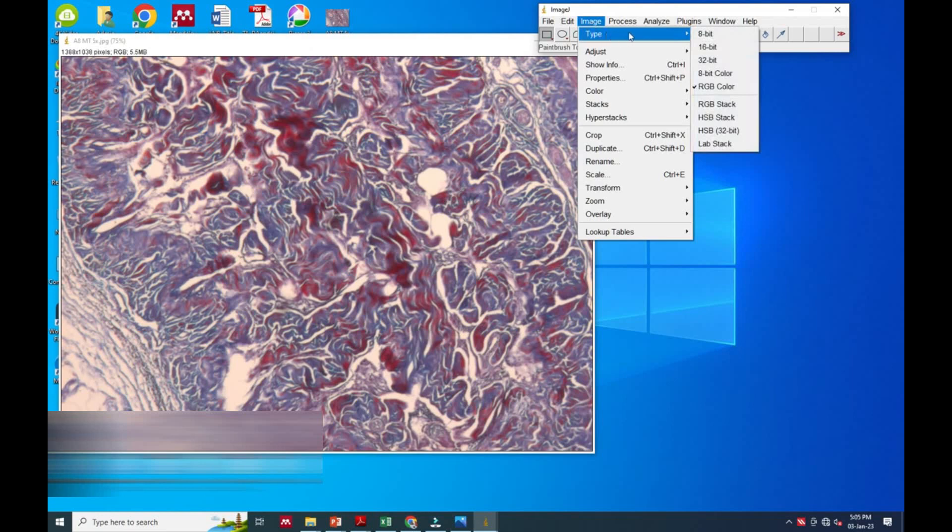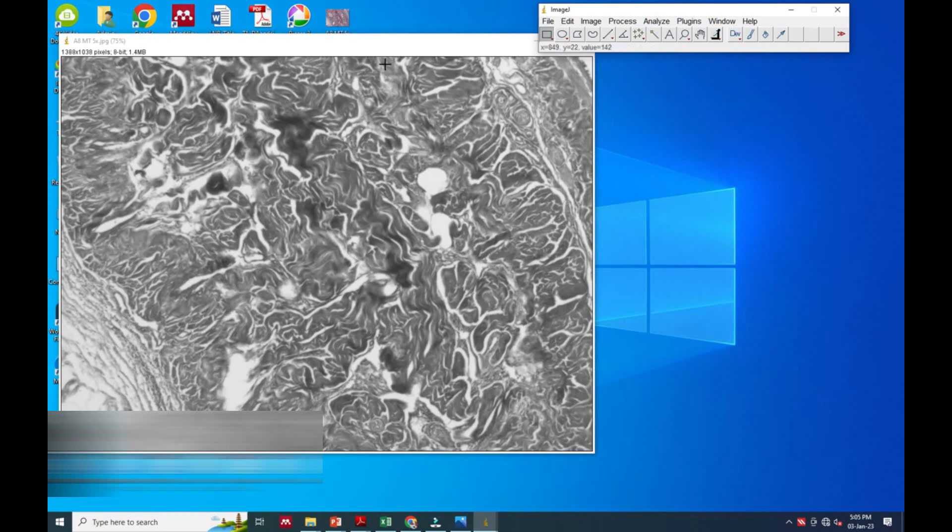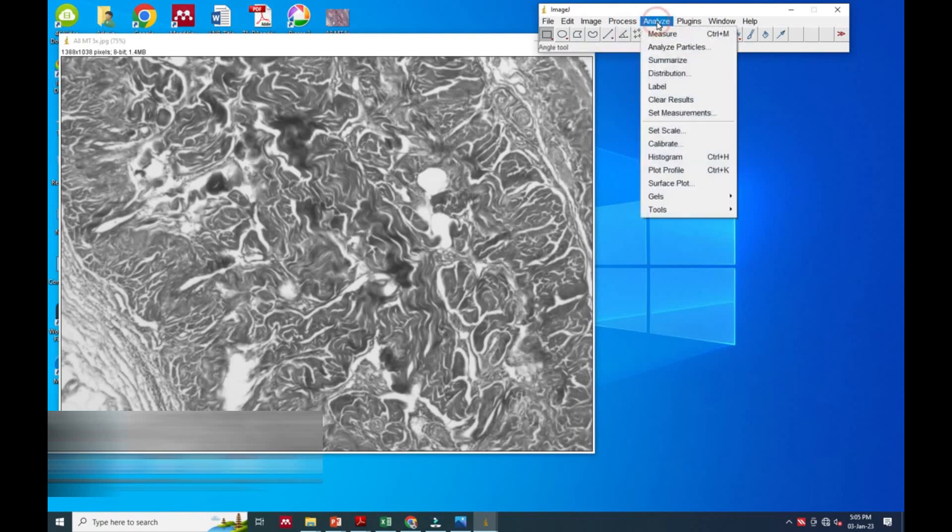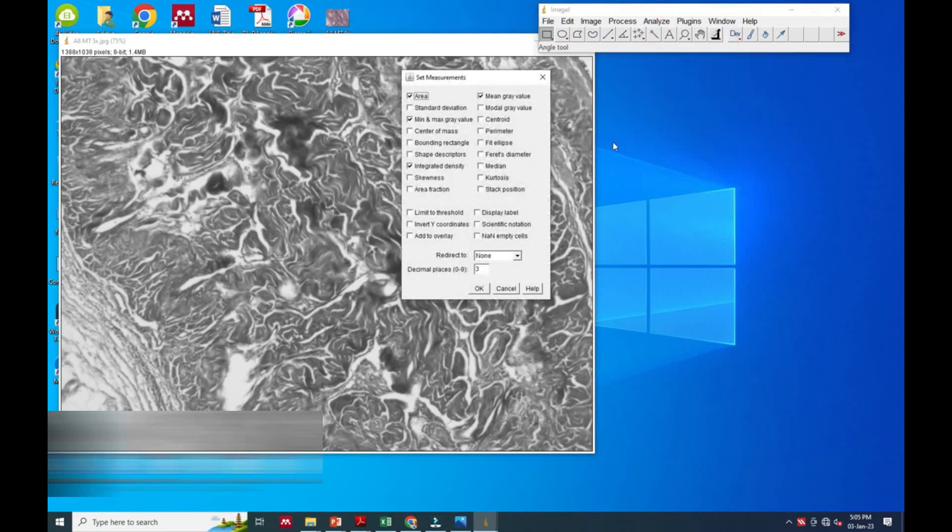In that we will go to Type, and in the Type drop menu we will go for 8-bit. With selection of 8-bit it will remove all image color. After that we will go to Analyze option. In that we have to go for Set Measurement option.